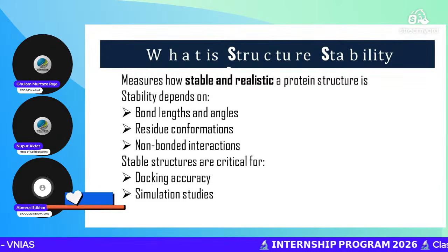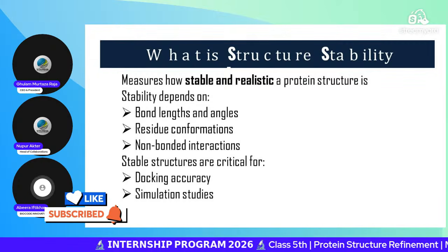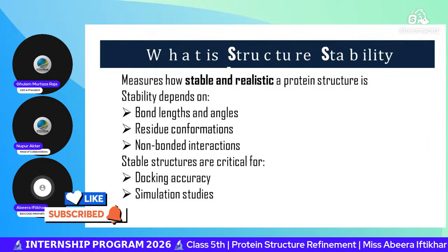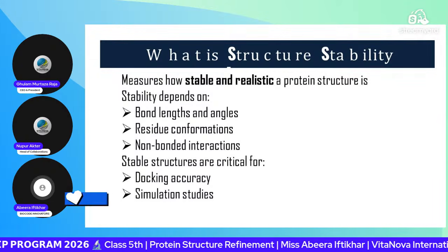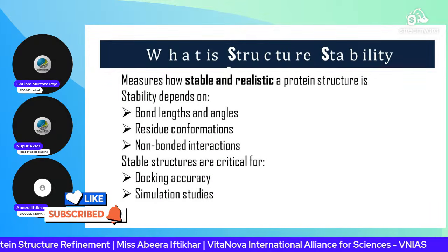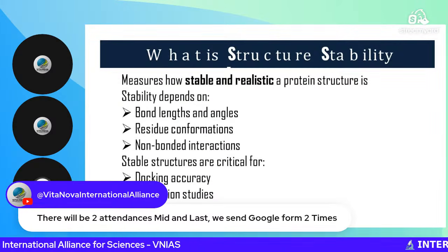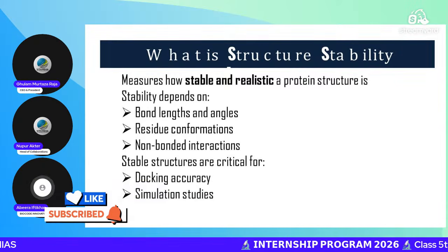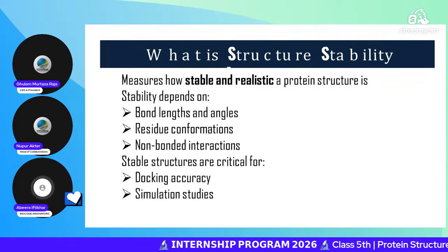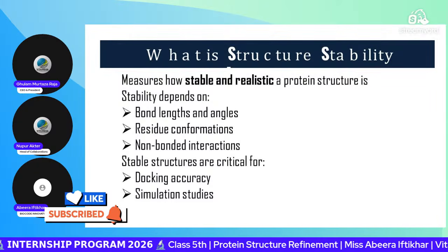So make sure you take note of the resolution range. If it is falling within the range of 0 to 2, then it is good. You can use it directly after the validation check. But if it is crossing the line of 3 to 4, or falling into the region of 2 to 4, we have to move toward refinement and then go for validation. You can even compare the pre- and post-refinement structures.